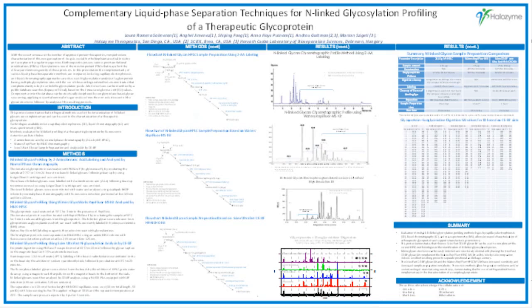Next is, what kind of injection method is used for this analysis, and will it affect sample composition? I'm assuming the question has to do with CE. It is a pressure injection, and since it's not electrokinetic injection, it doesn't affect the composition because we're not selectively pulling in, so it's only a pressure injection by CE.